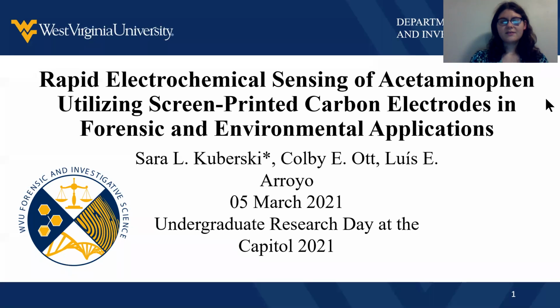Hello, my name is Sarah with the West Virginia University Department of Forensic and Investigative Science, and I'm here to tell you about my project, the rapid electrochemical sensing of acetaminophen using screen-printed carbon electrodes in forensic and environmental applications.